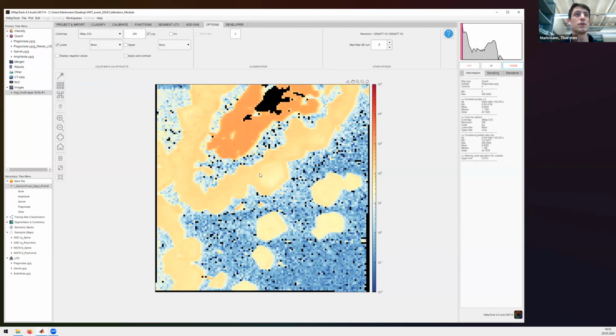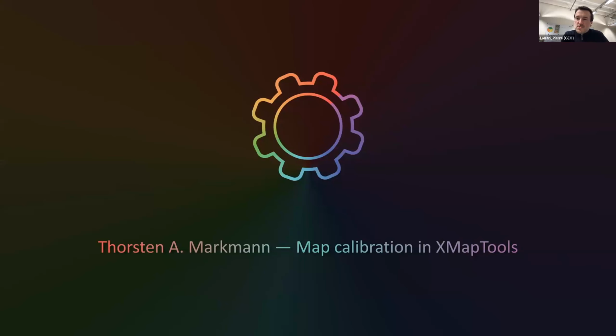And with this, the presentation for the quantification module is done. We have all mineral phases calibrated, and it goes back to you, Pierre. Thank you, Thorsten. I'm sure we'll continue in a few minutes, and you are still working in the background on that. So yes, that was the calibration module.